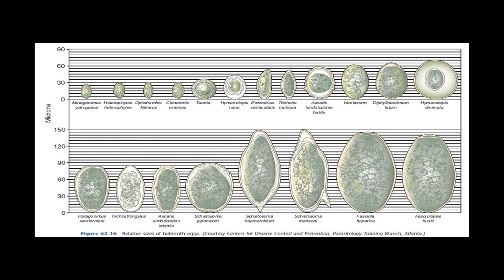And sometimes you might not be able to differentiate that from the rest, so you should have an atlas to look at in the lab and to compare that one with the ones that are present in the atlas, so you can make the diagnosis, and then following that, you should start the treatment accordingly and the prevention.